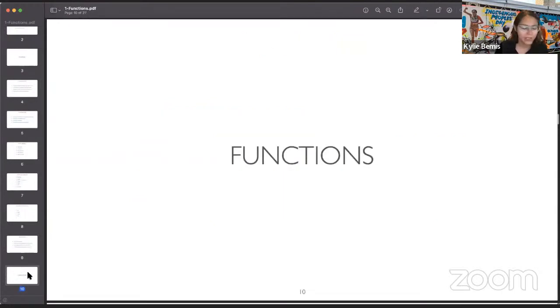All right, any quick questions on R basics before we talk about writing functions?